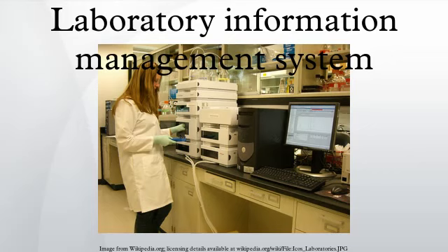The successful transfer of data files in Microsoft Excel and other formats, as well as the import and export of data to Oracle, SQL, and Microsoft Access databases is a pivotal aspect of the modern LIMS. In fact, the transition from proprietary databases to standardized database management systems such as Oracle and SQL has arguably had one of the biggest impacts on how data is managed and exchanged in laboratories.